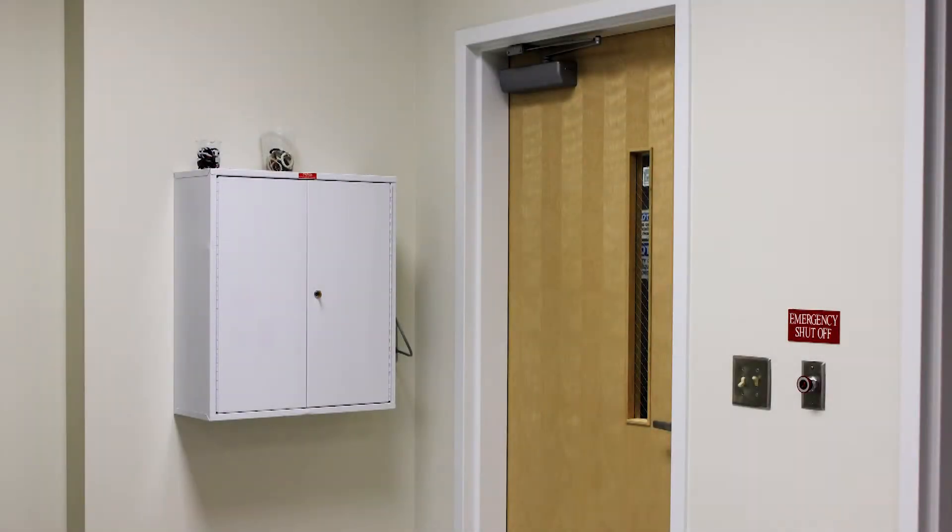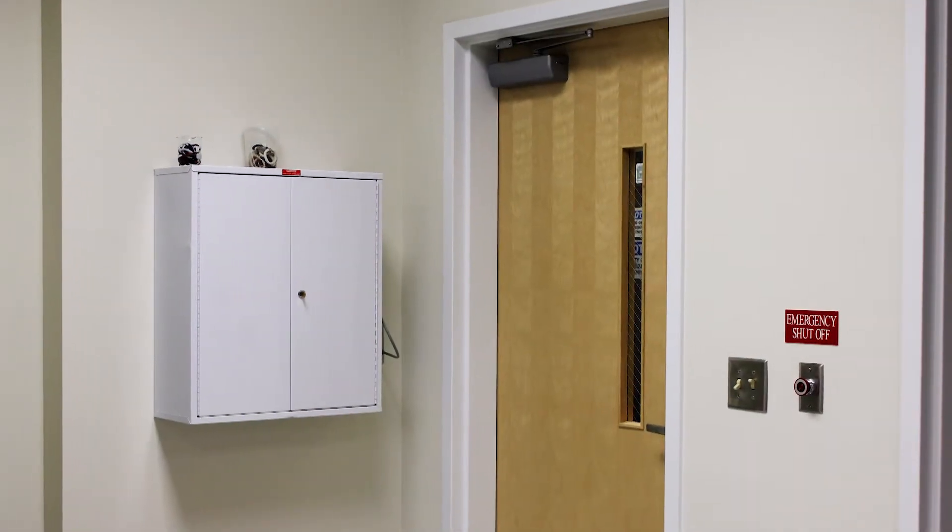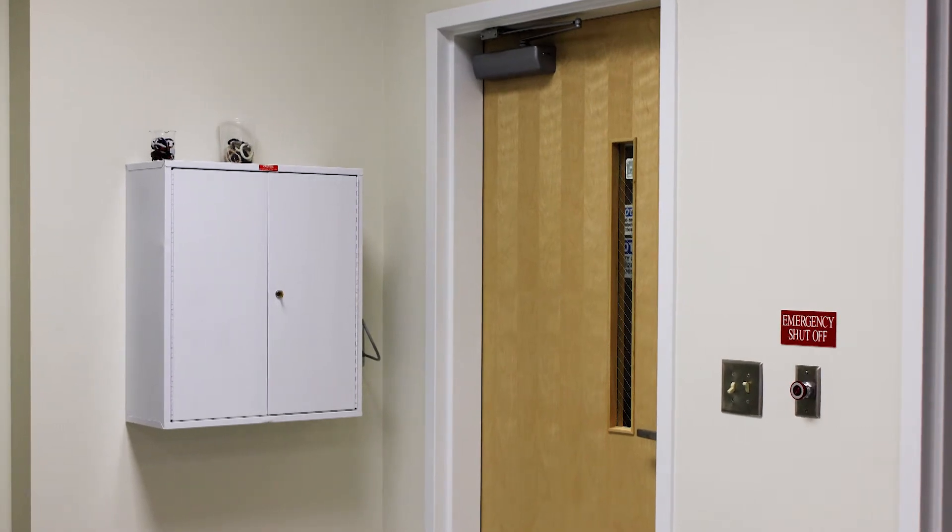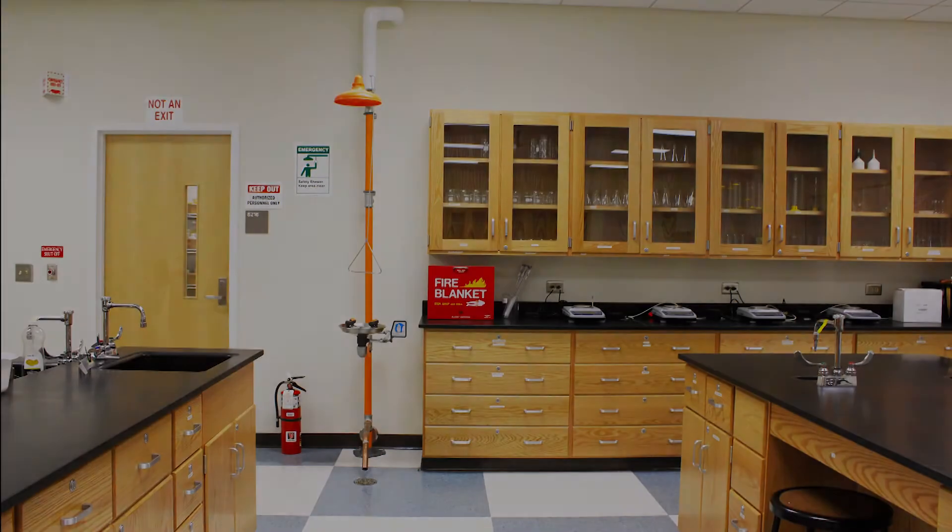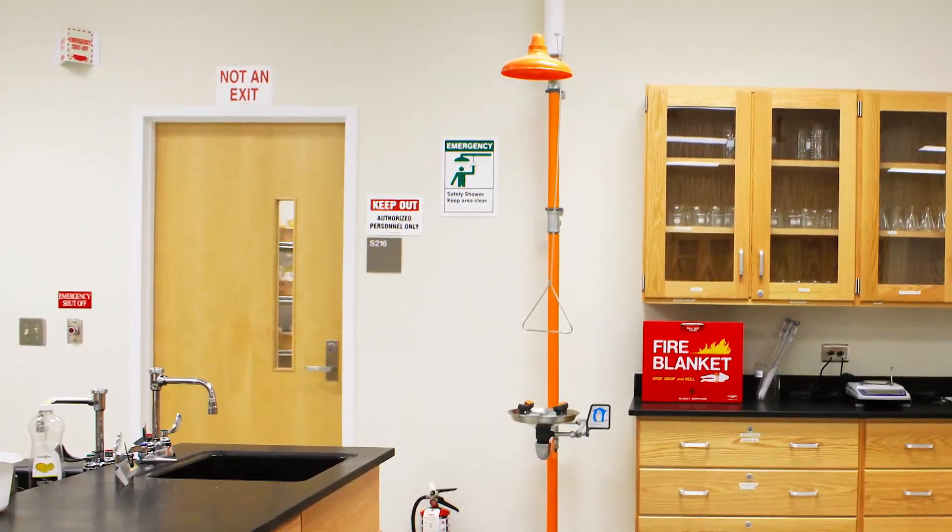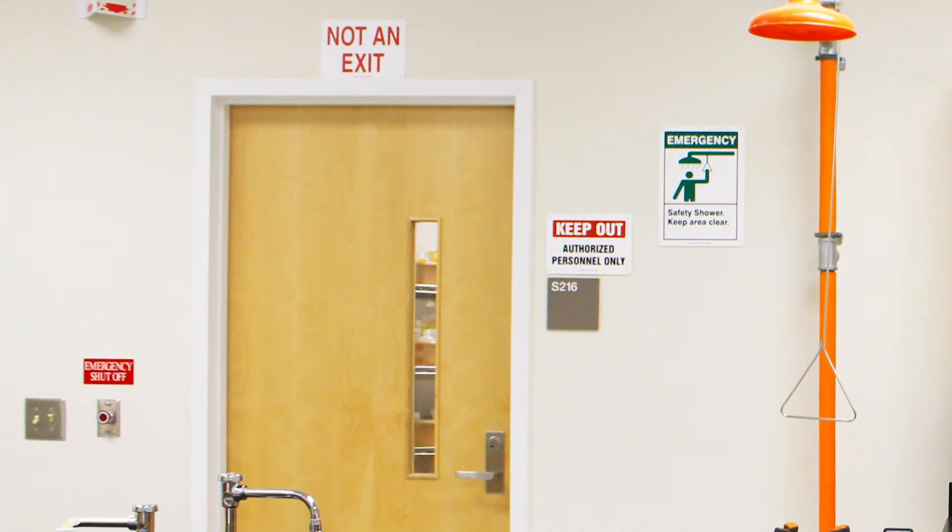If the primary exit is blocked, you would proceed through the secondary exit door, which is the door you entered from, and follow the instructions of your instructor to safely exit the building. Note that this door is the entrance to a prep room and is not an emergency exit. In all emergency situations, you should remain calm and listen for instructions from your instructor.